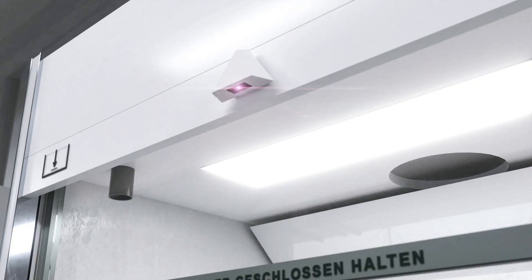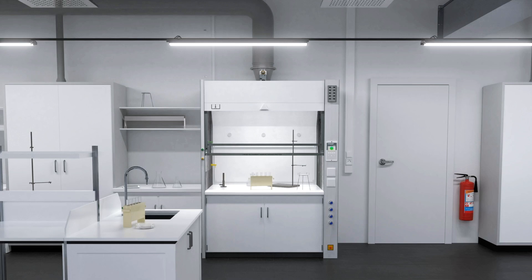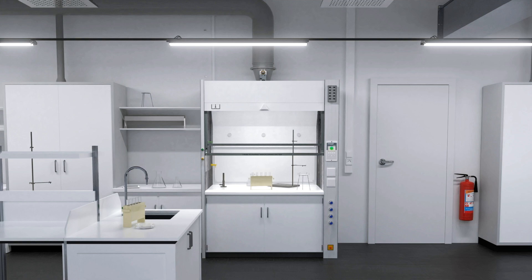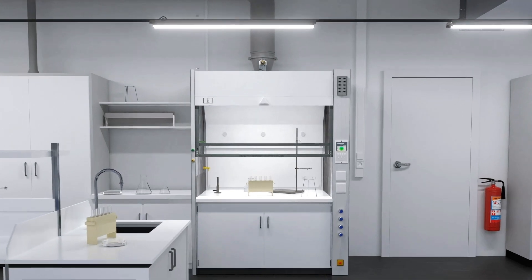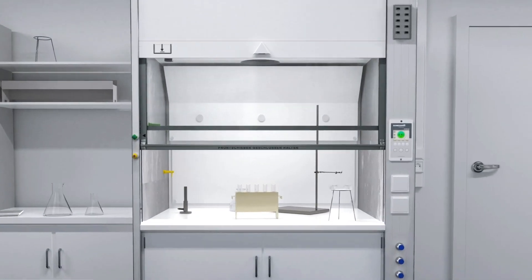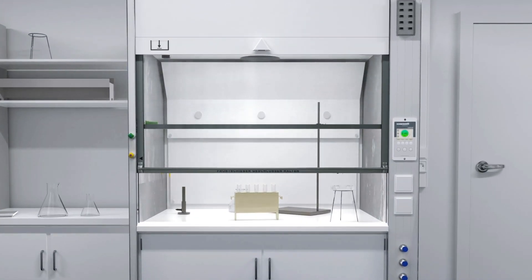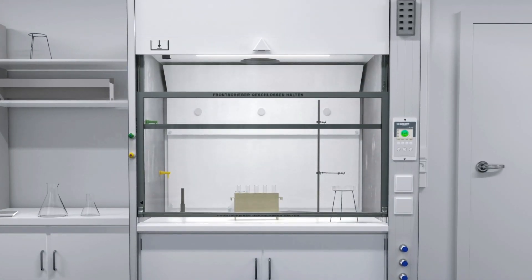A sensor on top of the fume hood detects movement in the area in front, and it automatically closes the sash if there is no laboratory worker. The automatic front door enables energy savings of 50% and additionally limits the risk of any leakage.